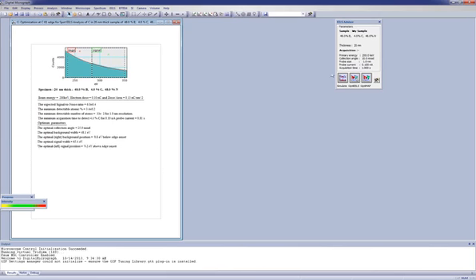So finally, the software comes up with this report that shows the edge, the elements, and the optimized spectrum. So it gives a summary of the spectrum, the specimen, which is 20 nanometers thick, with 48% boron, 48% nitrogen, and 4% carbon. These are the beam parameters: 200 kV, electron dose, and dose per unit area given.